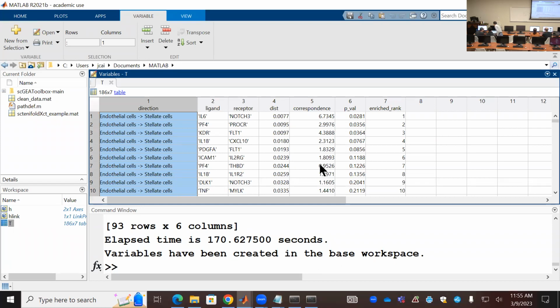Maybe just override, maybe just reinstall this. You shouldn't have that problem because everything has been tested. Inside here, you should have the geo function. So it's not there, right? But if you check your version, you should have that in there.